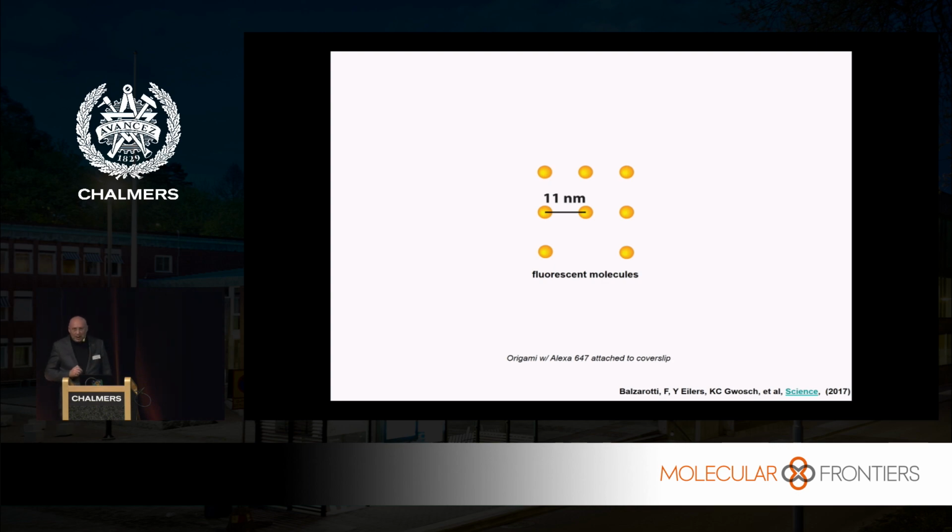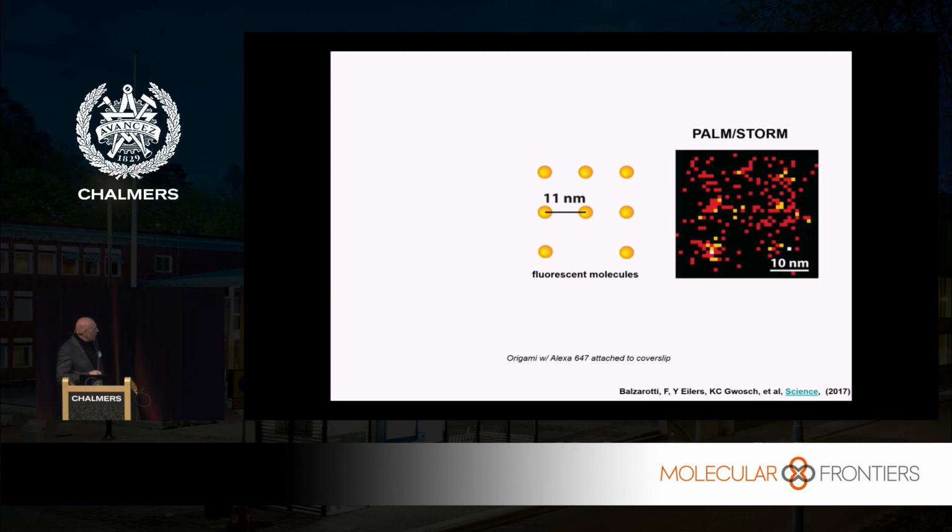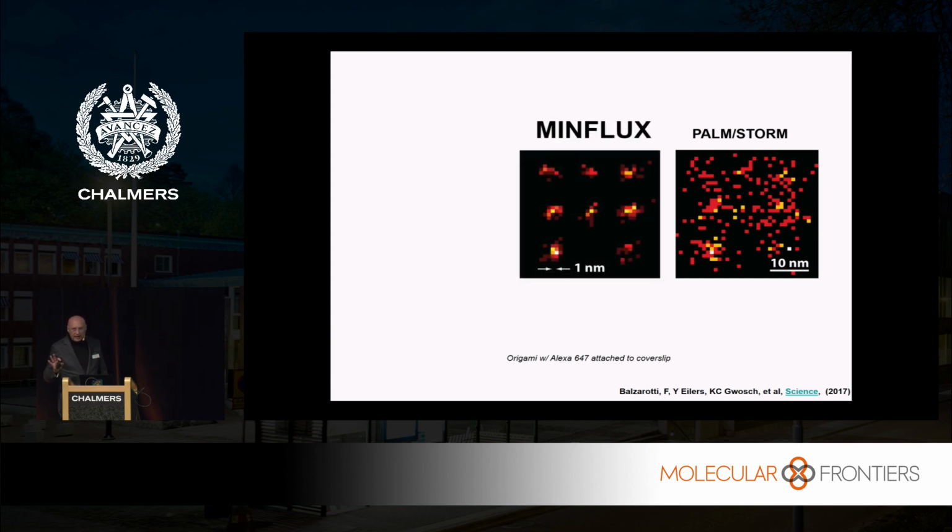At the time the Nobel Prize was given, this is a PALM/STORM recording, these molecules could not be separated. Neither with PALM/STORM nor with that, because they are too close. The resolution was not there. I said about 20 nanometers was the maximum resolution. Now with this MINFLUX concept, you take them apart. You turn the molecules on individually, locate them with the donut, and here you have it.